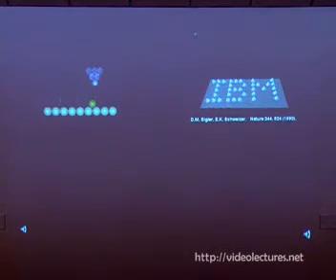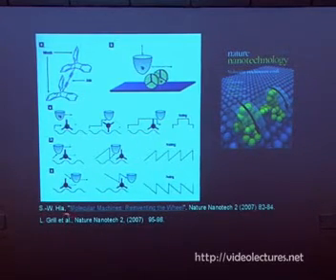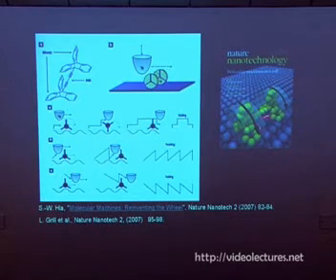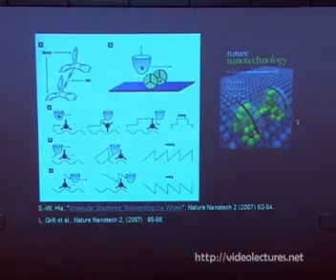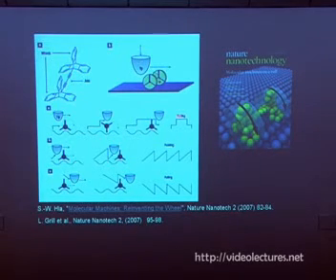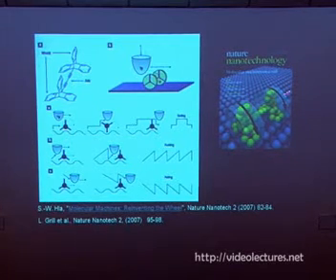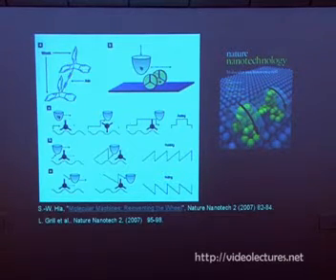And this technique is not just to move the atoms around. We can also use it, for example, this is a recent paper published by my former group, and I also have a comment paper there. For example, rolling of a molecular machine on the surface. This was in Nature Nanotechnology in 2007. We can not only move the atoms and molecules, but also induce other functions like rolling or mechanical function, and we can detect the signal of the rolling, how a molecule is rolling, for example. In this case, the molecular wheel, these are the 2 wheels connected with a chain of molecules on the surface. So this is now an emerging research field to build molecular devices or mechanical devices.